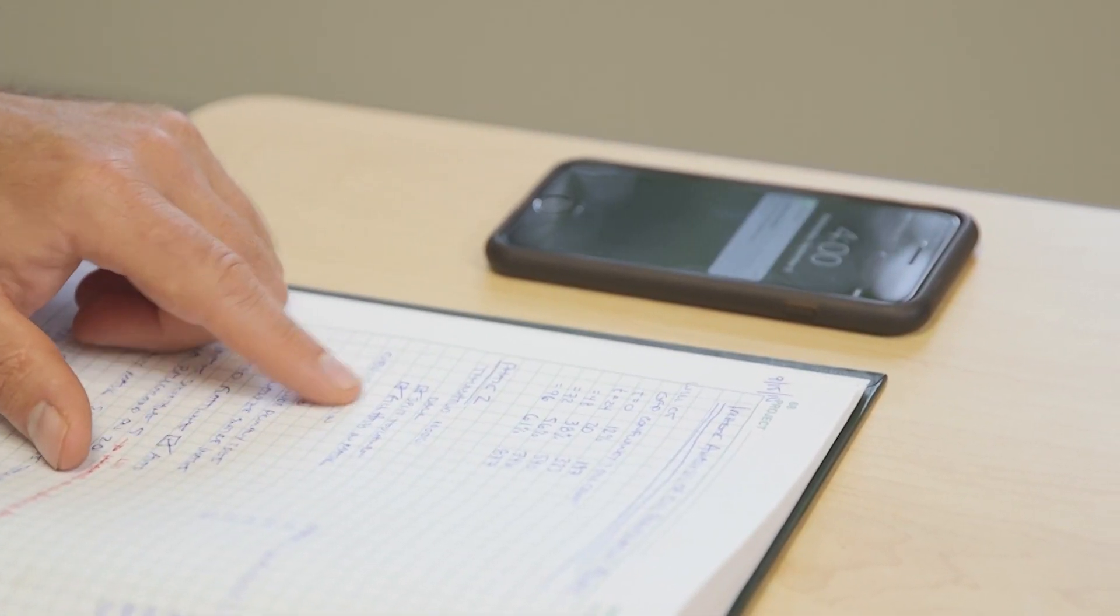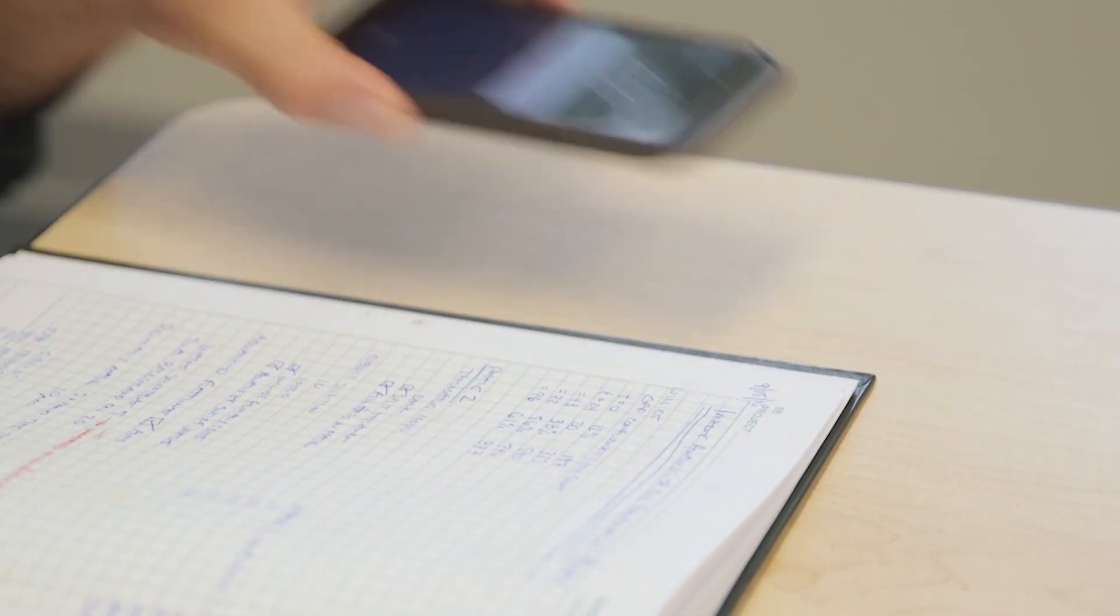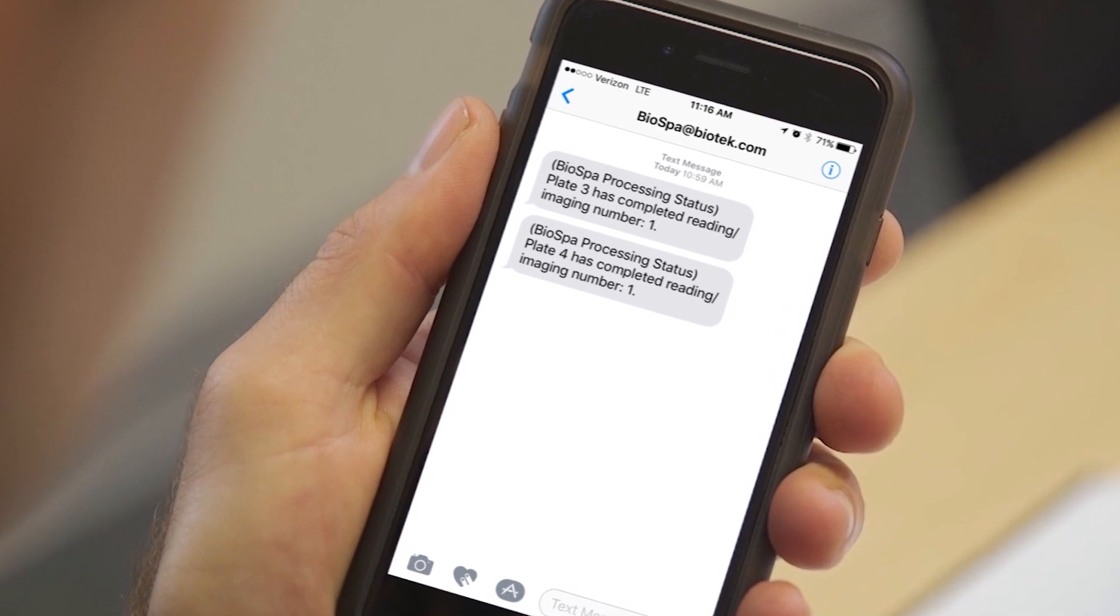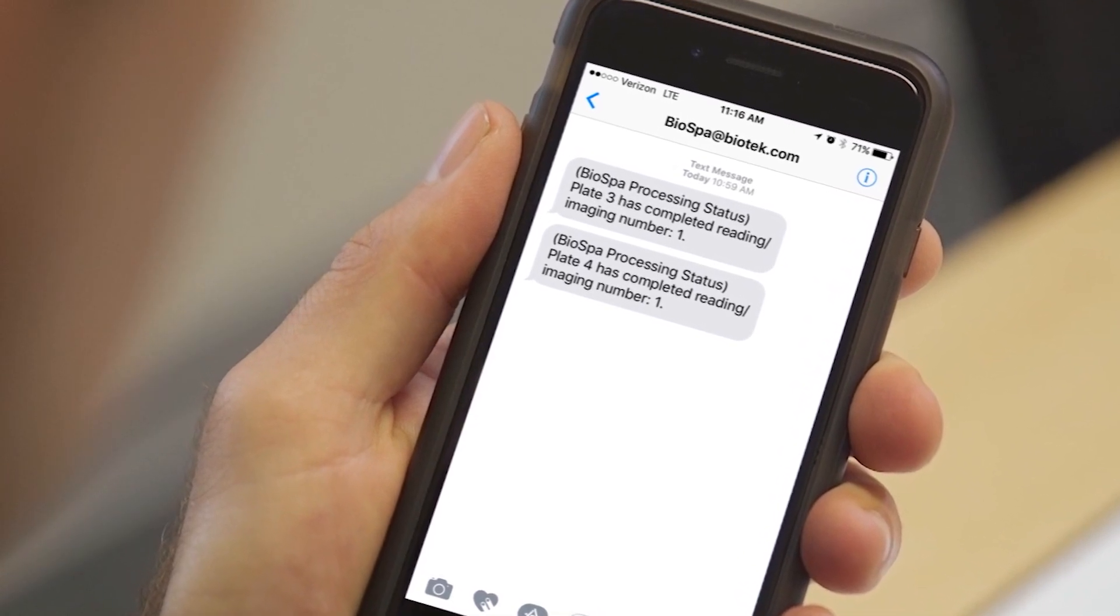Notifications can also be set up for each protocol to alert the user that the step has been completed, including emails or texts to the user's computer or cell phone.